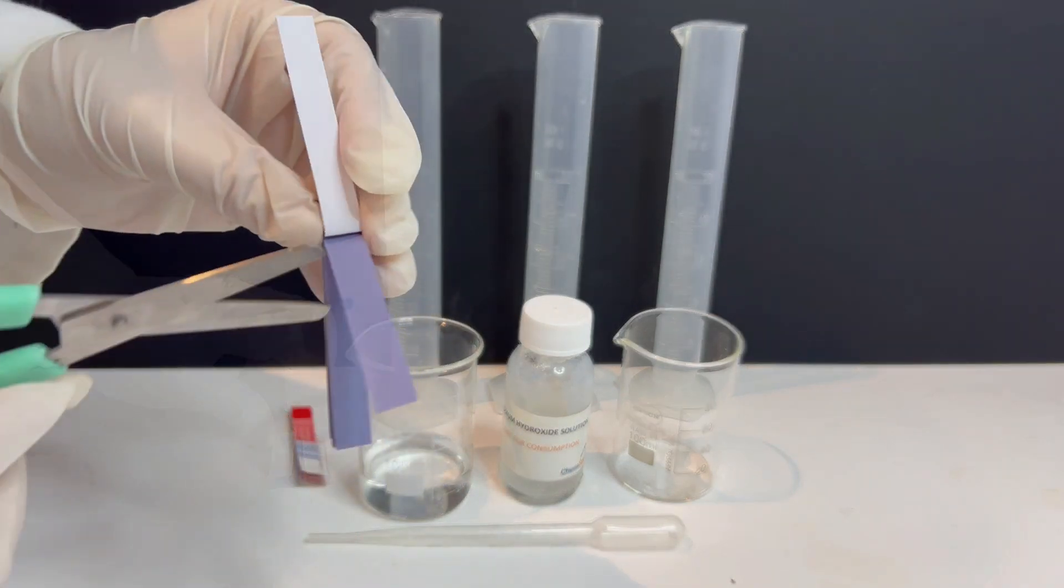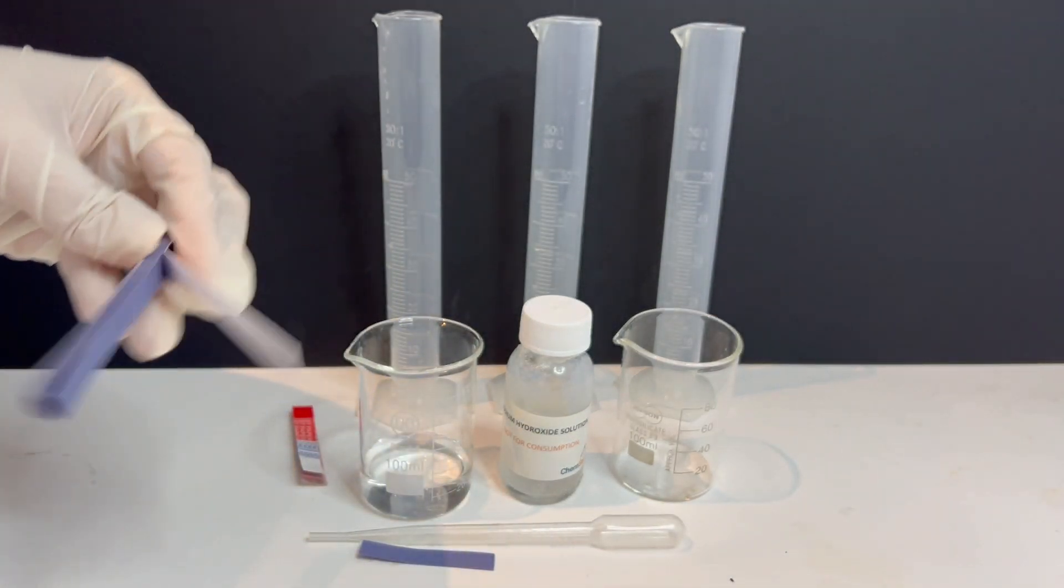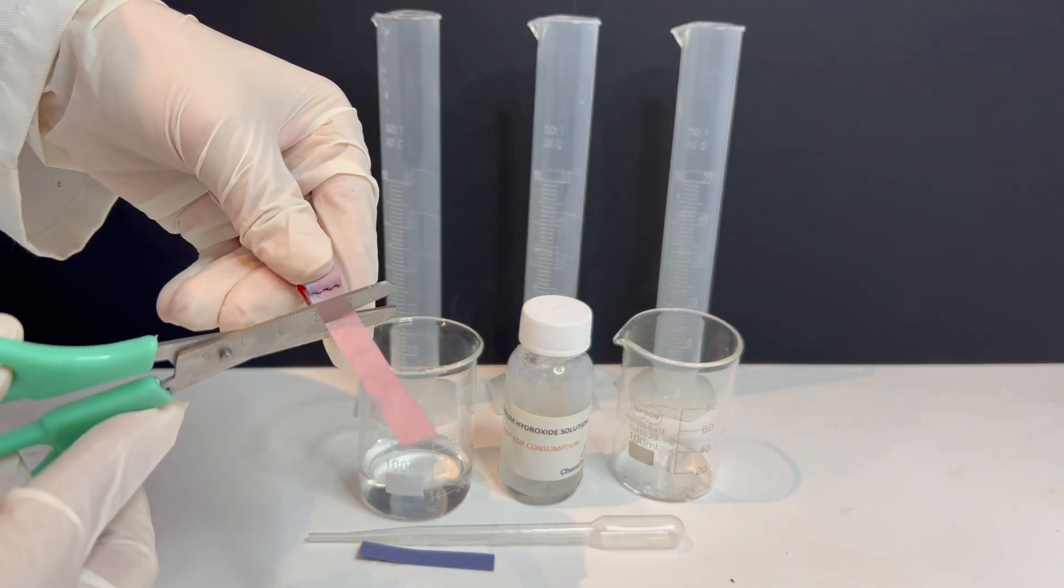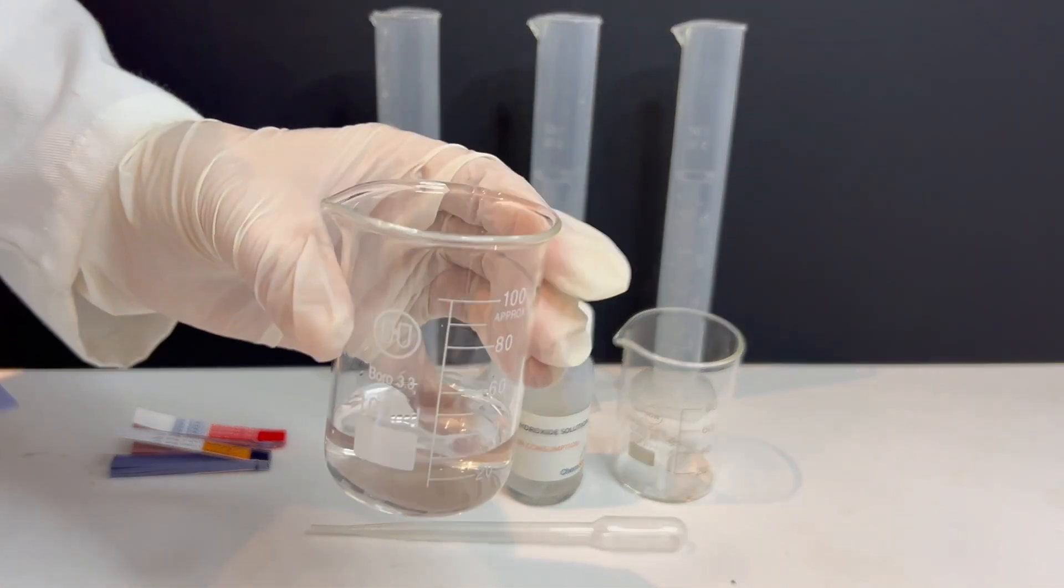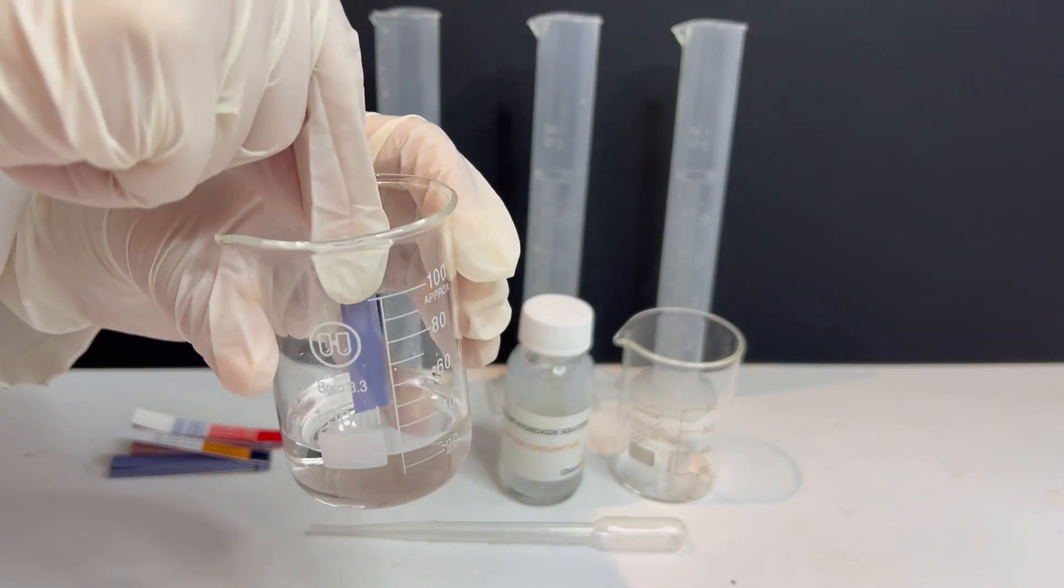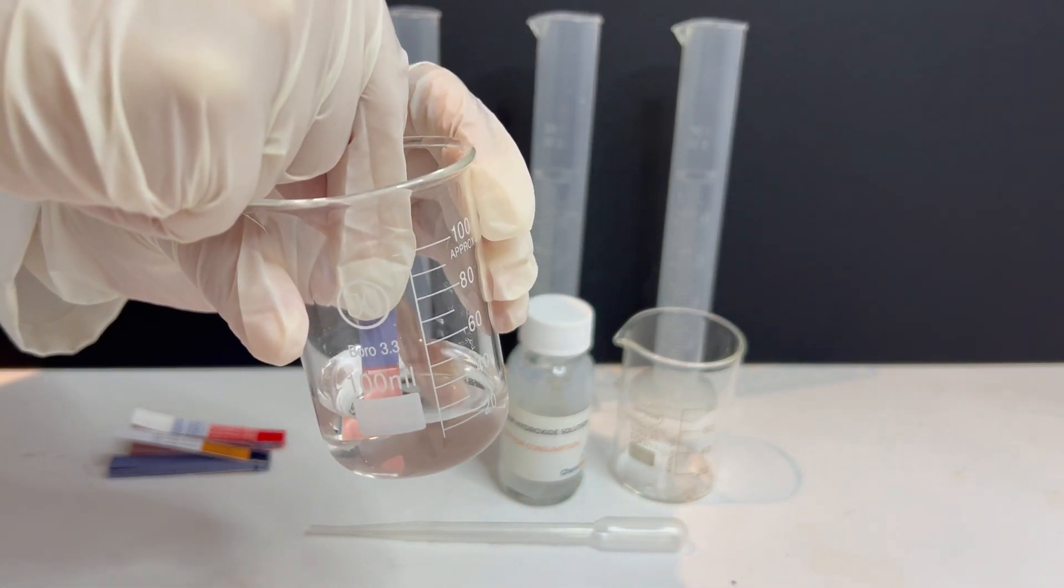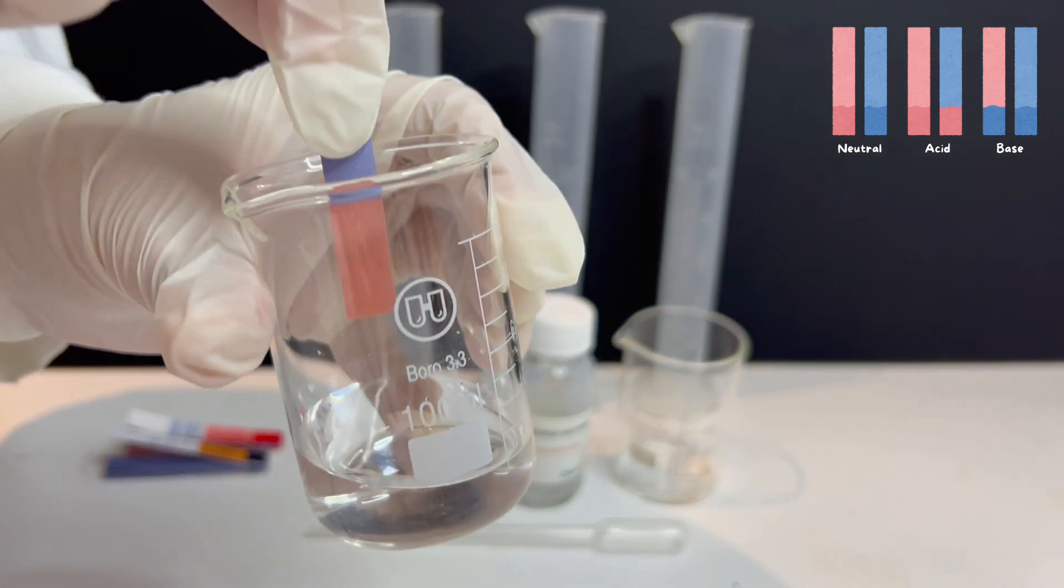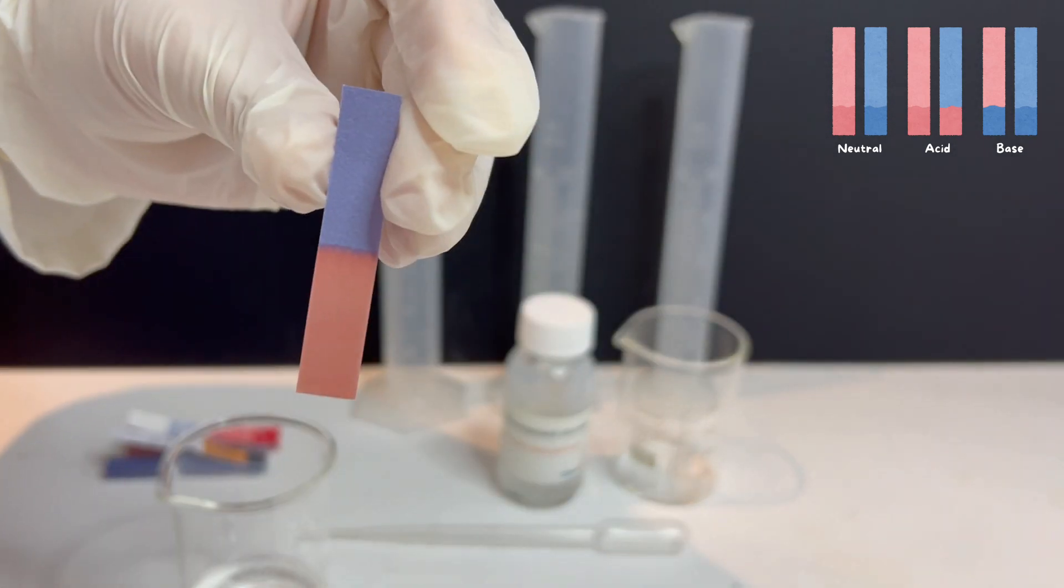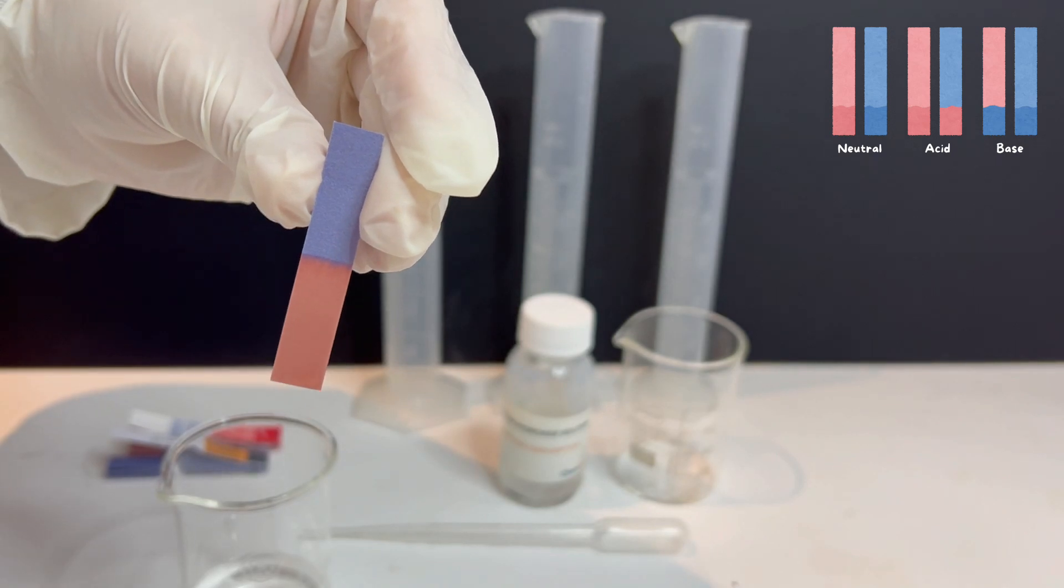I now use my scissors to cut a small piece of blue litmus paper and a small piece of red litmus paper. Let's start with the blue litmus paper. I dip the blue litmus into the vinegar solution. Immediately I notice that the blue litmus paper turns red. This tells me that vinegar is an acidic substance. It's an acid.